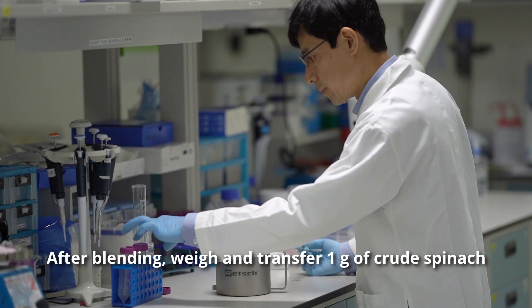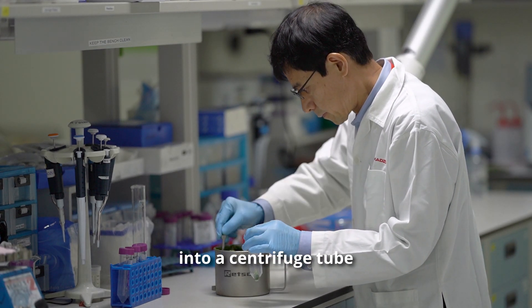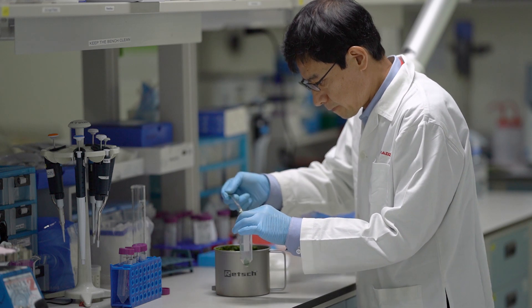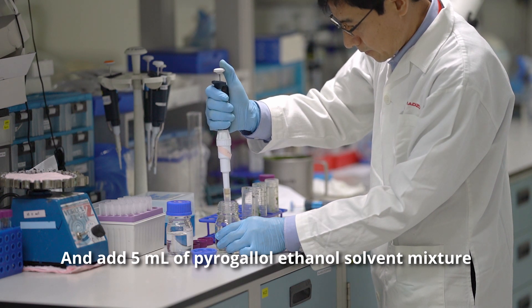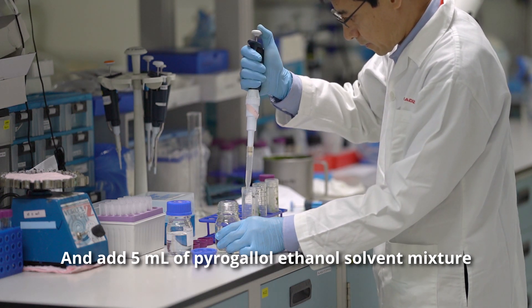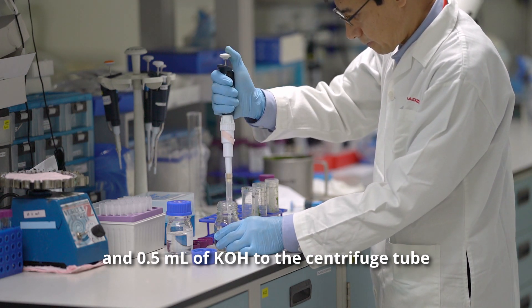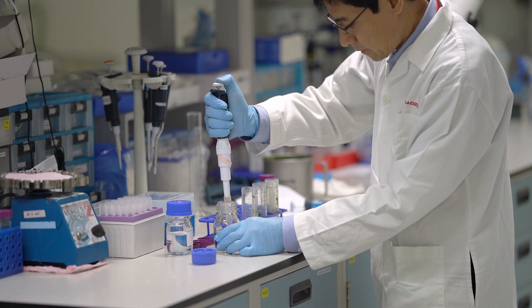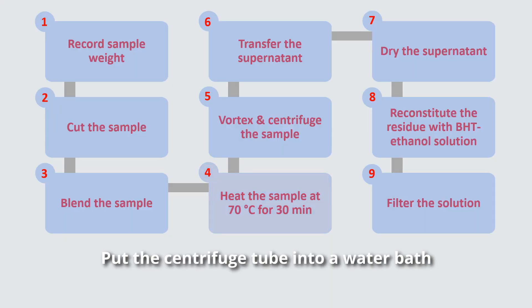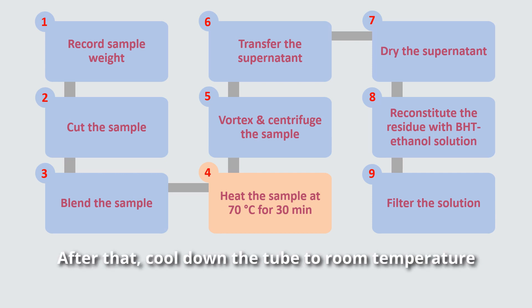After blending, we transfer 1 gram of crude spinach into a centrifuge tube. Add 5 ml of the solvent mixture and 0.5 ml of potassium hydroxide to the centrifuge tube. Shake the tube gently. Put the centrifuge tube into a water bath and heat it at 70 degrees for 30 minutes. After that, cool down the tube to room temperature.